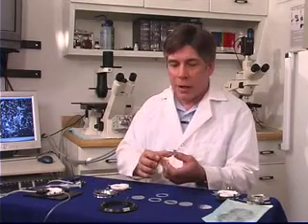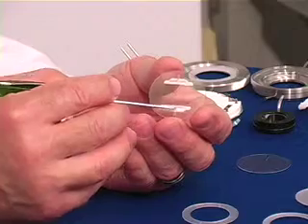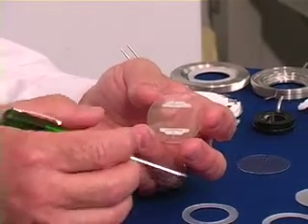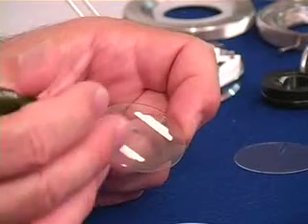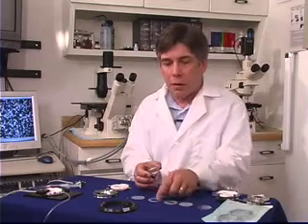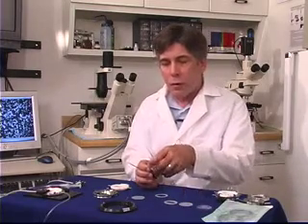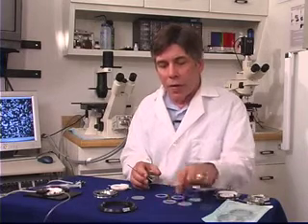First, I'll discuss the microaqueduct slide. Being the heart of the system, there's a lot going on with this little piece of glass. The glass is one millimeter thick and has microaqueduct grooves cut into the inside portion — the part close to your cells in the optical cavity. It also has perfusion ports on either end of the microaqueduct grooves. The opposite side is coated with indium tin oxide, an electrically conductive, optically transparent material. Two bus bars are applied to uniformly create a flow of electrons across the glass surface. This electrical flow produces heat transferred into the optical cavity formed by the inside surface of the microaqueduct slide, a gasket, and a cover slip. By selecting gaskets of different thicknesses and internal geometries, you can completely control the flow characteristics within the optical cavity.